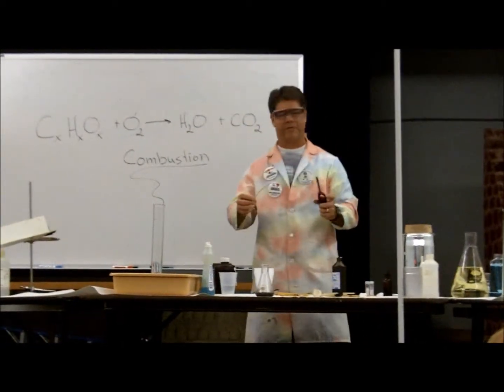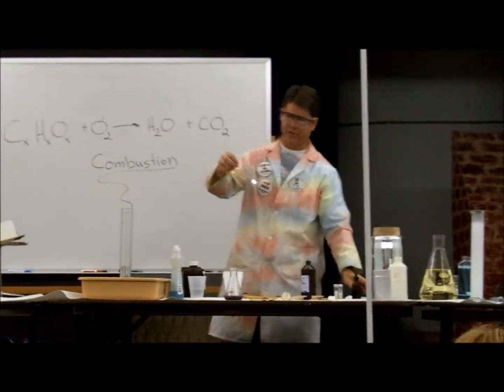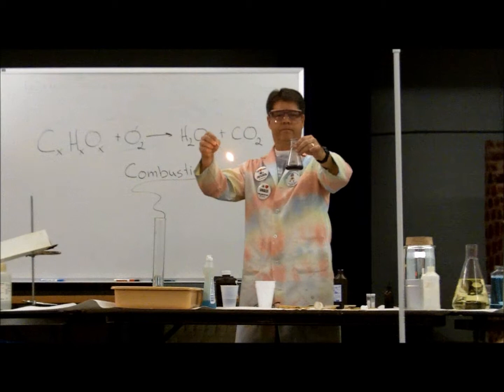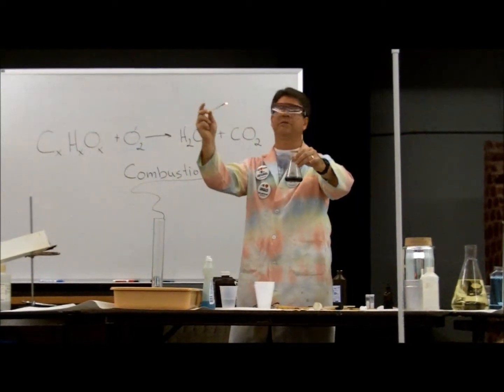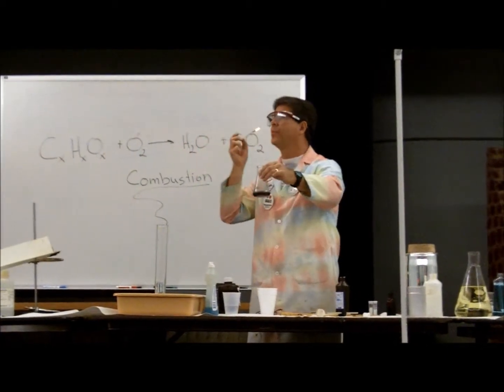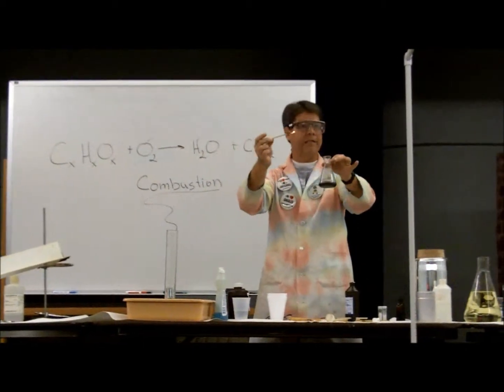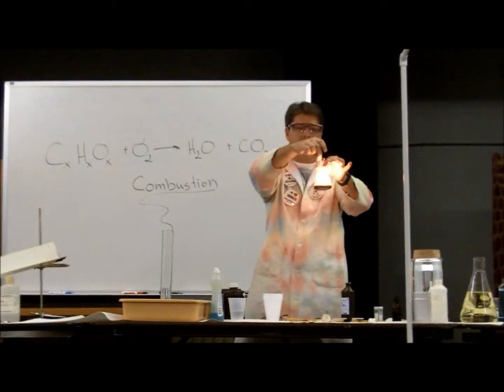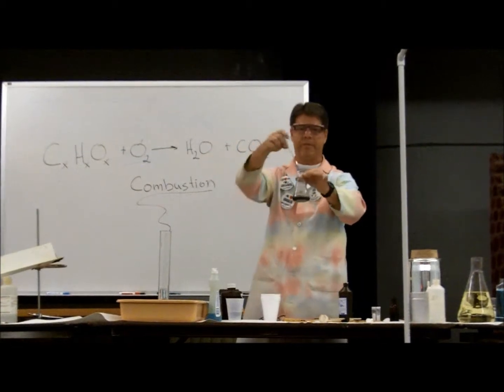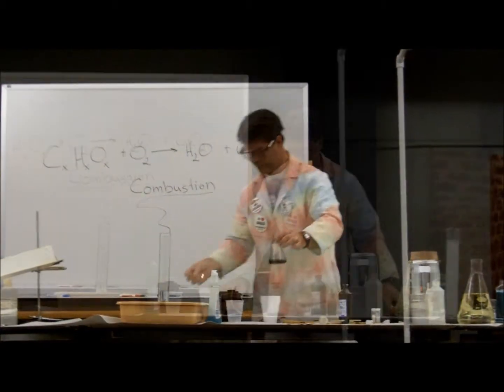A simple test that we do for the presence of oxygen is exactly how it handles combustion or burning. When I blow this out and it's glowing red and I put it in the presence of a large amount of oxygen, it just simply relights. And this is actually a little laboratory test that a chemist would do to test for the presence of oxygen. You take a red glowing wood splint, you put it in the presence of oxygen, it lights, ding, ding, ding, ding, you've got oxygen.